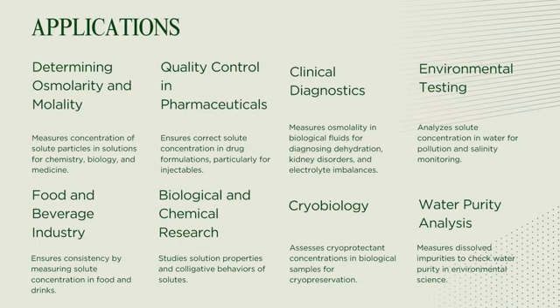Now its applications. There are various applications. Freezing point osmometer is used to calculate the osmolarity or molality of a solution by measuring the freezing point depression. This is crucial in chemistry, biology, and medicine. It ensures the correct concentration of active ingredients in drug formulations. Accurate osmolarity is important for injectable drugs, as incorrect osmolarity can lead to adverse reactions.